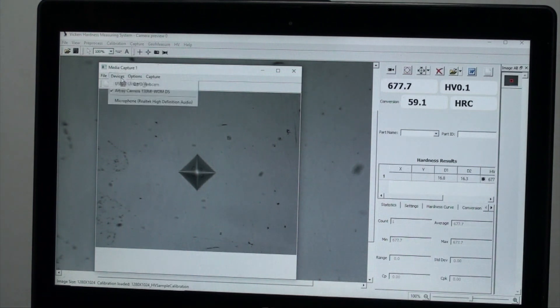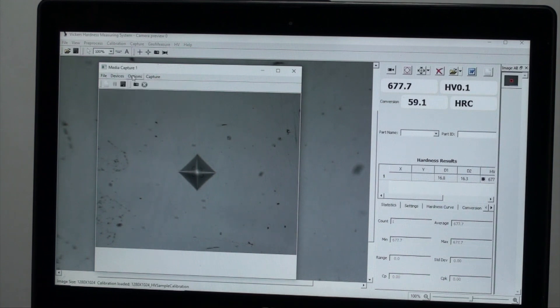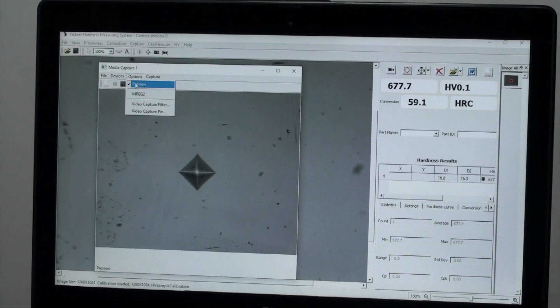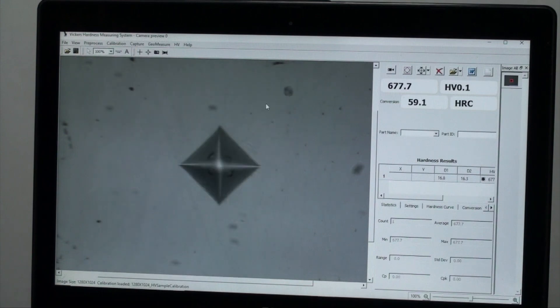Then devices, select the R-Trade camera. Next move to options and select preview. This will open a preview screen and confirm the camera is working properly. Then close the preview screen.